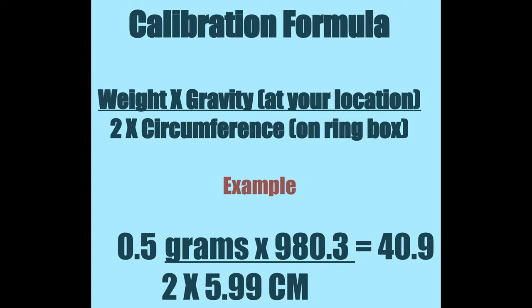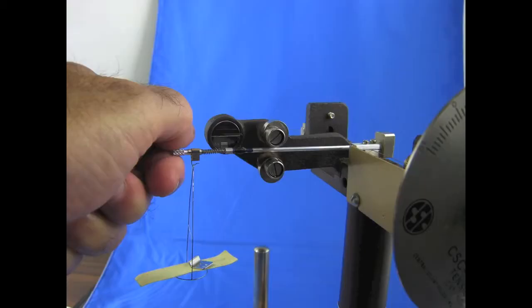If the dial reading you recorded and the calibrated number are within 0.5 dynes of each other, you are finished. If the two numbers are farther apart, however, you will have to adjust the torsion arm.